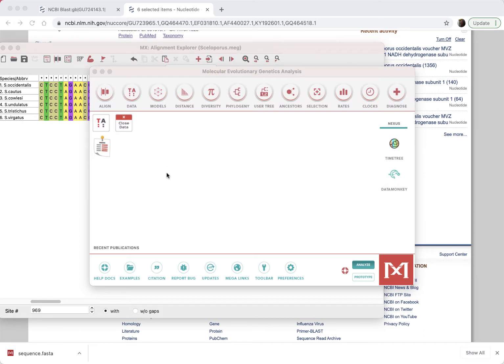But we don't really need to look at that. What we're going to do here, okay, so if you've gotten this far, you've gotten your sequences downloaded in a FASTA format. You've gotten your sequences aligned using Mega. Okay. You imported it using the alignment function in Mega, and you're able to truncate the names, so you only have the names of the species without all that other extraneous information. You have aligned it, and then you've clipped off the portions of the data file that don't really match up. Okay. And now your work is basically almost done because Mega does the rest for you without much thinking.